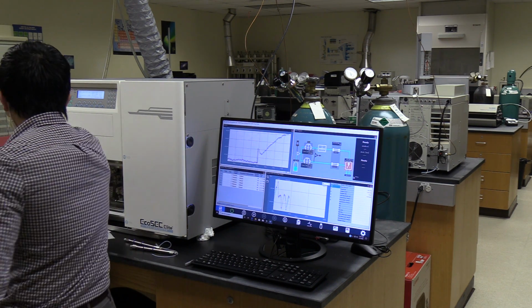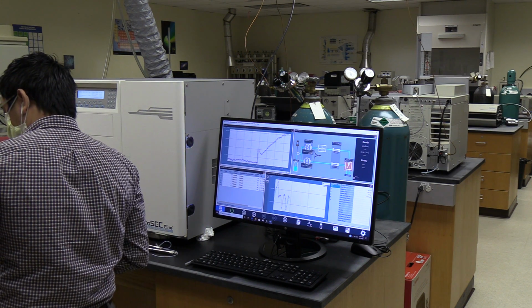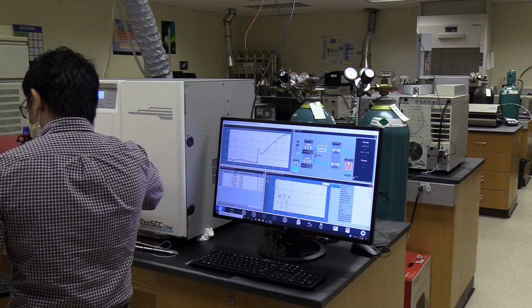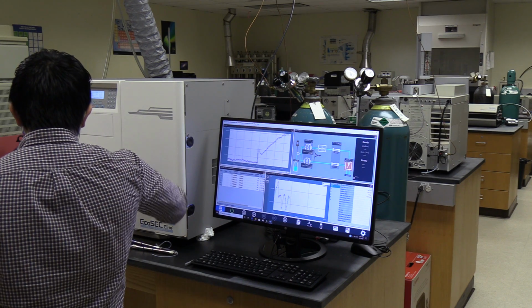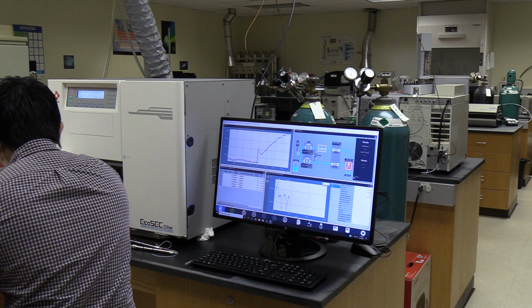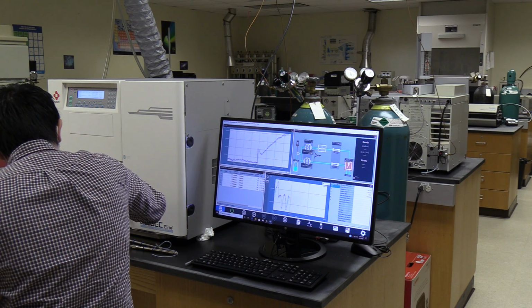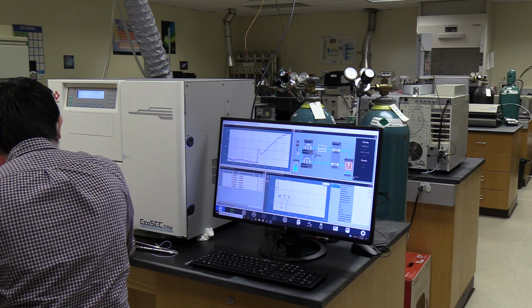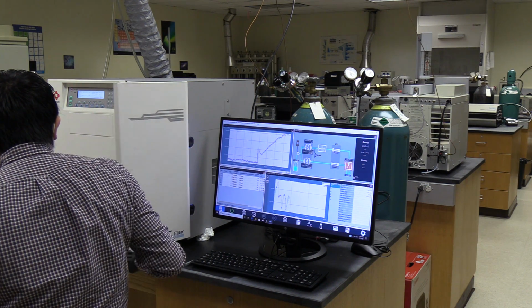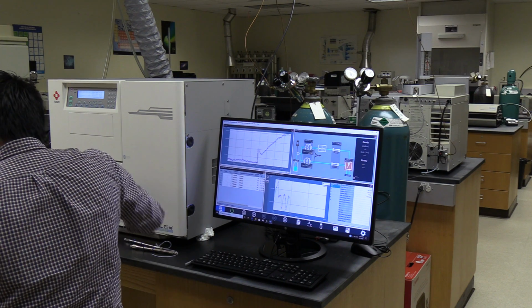You would open this pump oven, or this column oven, by hitting the button underneath the door. And when you need to close it, you would close the door and then push here where it says close. Same thing for your column oven. You would press the button near the column oven door to open it, and if you need to close it, you can just push here where it says close.